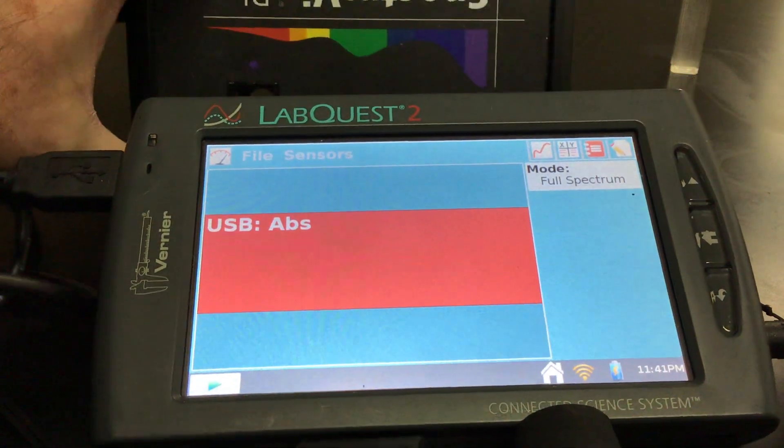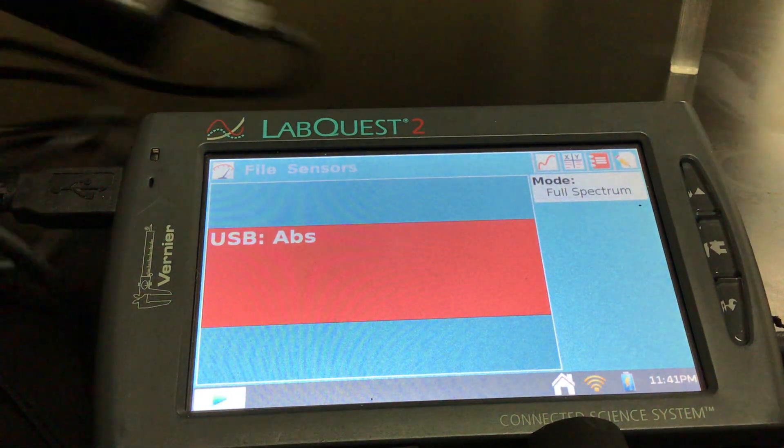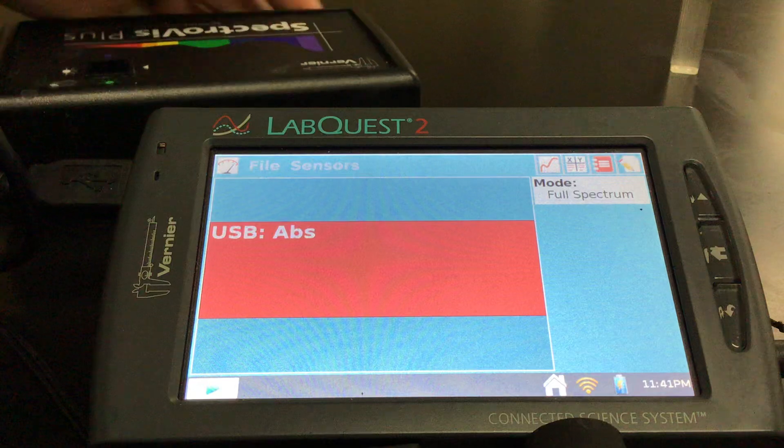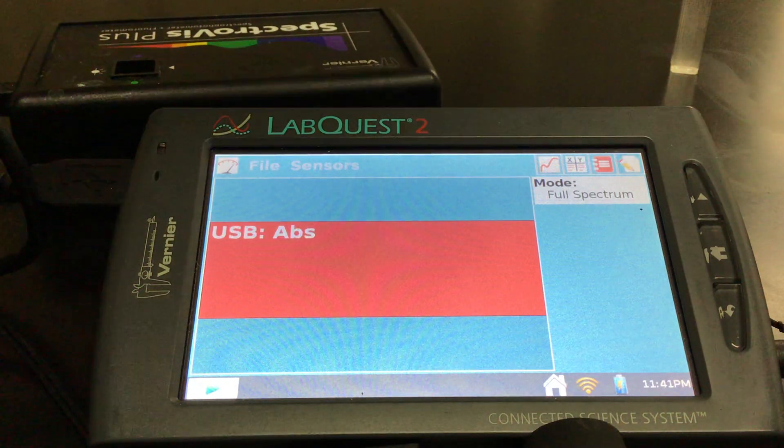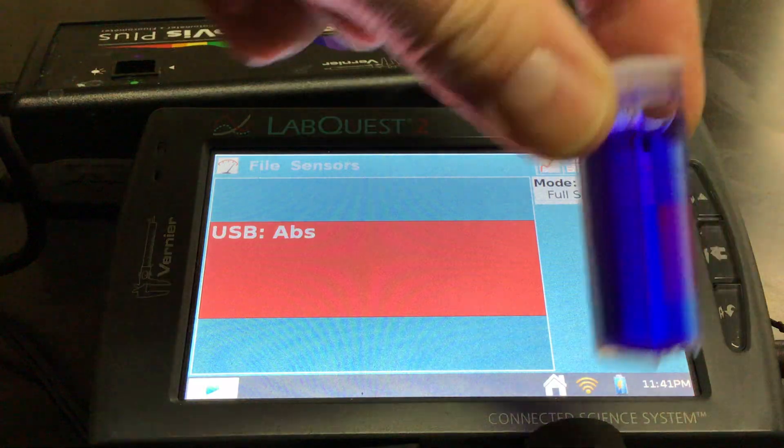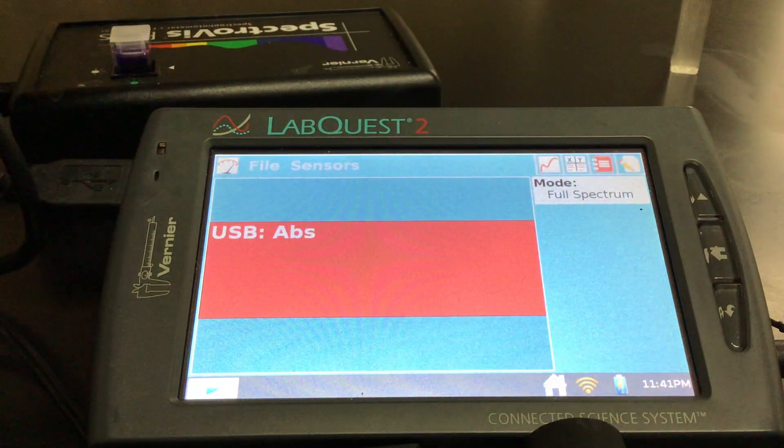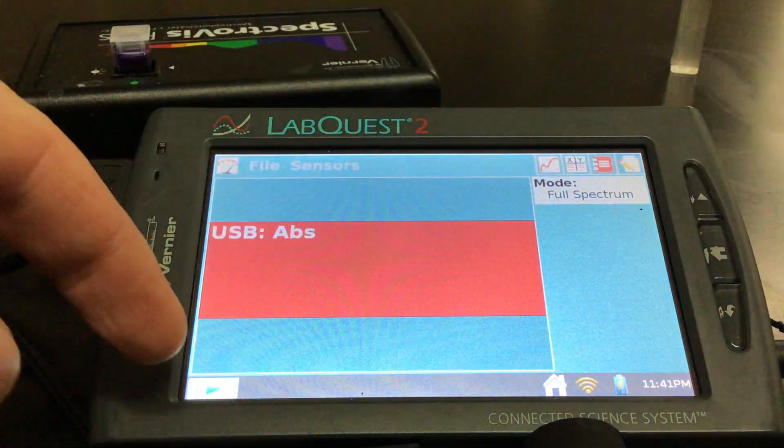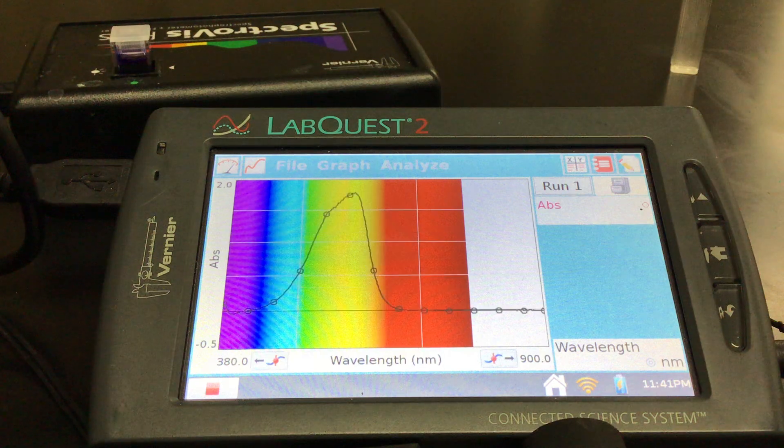It's upside down and I've already run my blank. What I'm going to do is choose the wavelength that's most appropriate here. I've got a little cuvette of crystal violet and set that in my spectro viz. I'm in full spectrum mode and we're gonna hit play here.